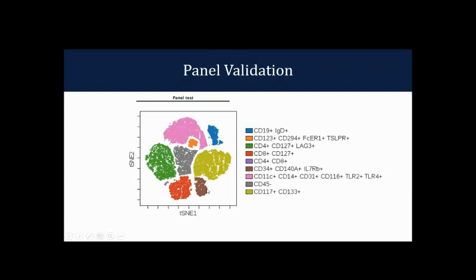What we see here is some downstream post-analysis work using a clustering algorithm, which I'll get to in a moment. What we saw was that we were really able to discern unique cell populations by certain markers that we were testing. So we really like to validate that. And of course, before this, you would look at the biaxial plots also to ensure that those actually show a shift in signal or a real signal.